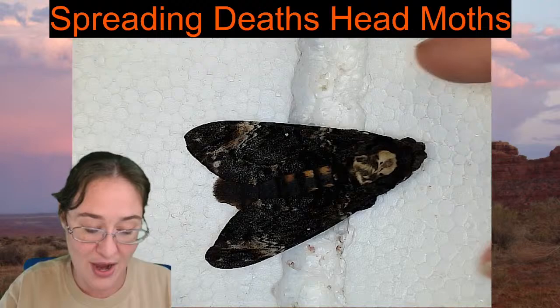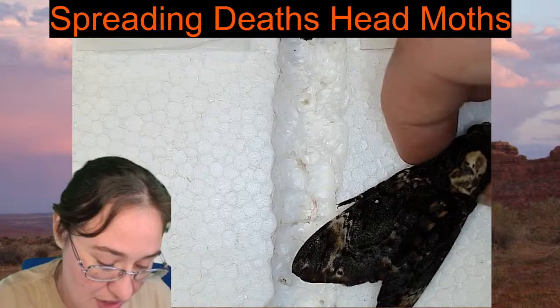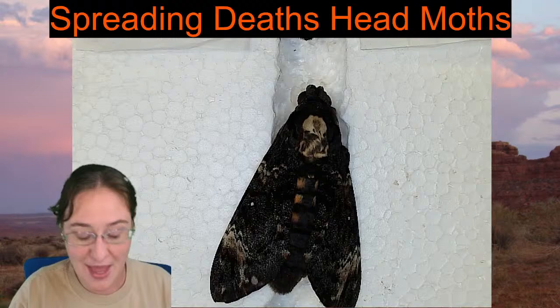And so we have a homemade spreading board here. It's just two pieces of styrofoam. One I took a heat knife to actually yesterday, and we built this one.